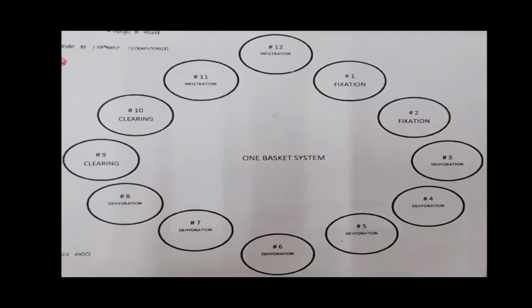So this is what makes our lives easier in the histopath laboratory with the help of the Autotechnicon.